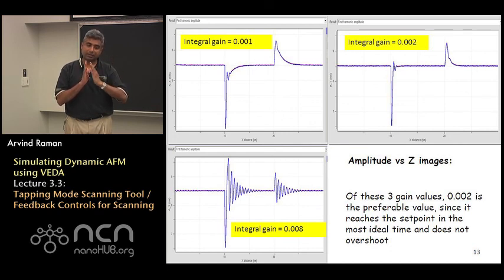As the gain increases, it's able to quickly recover its amplitude by moving the base of the cantilever pretty fast. However, if the gain becomes too high, you can see that the error signal becomes unstable, leading to oscillatory kind of behavior near the edges of the sample feature.